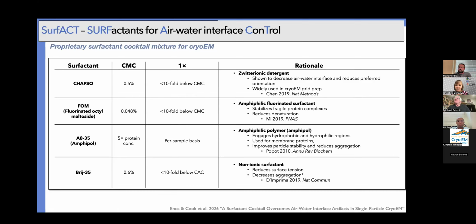This is a good question. Do you expect the surfactants to saturate the air-water interface at their respective concentrations in surfact? This is what we're thinking: if it's not completely saturating the air-water interface, it's doing so to such an extent that you're not allowing the particles to bounce on and off the numerous times that's anticipated based on modeling.